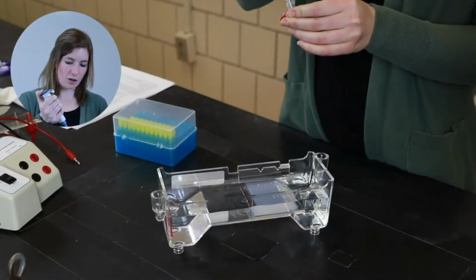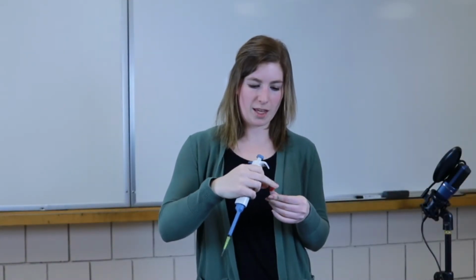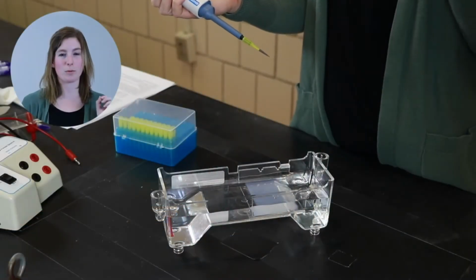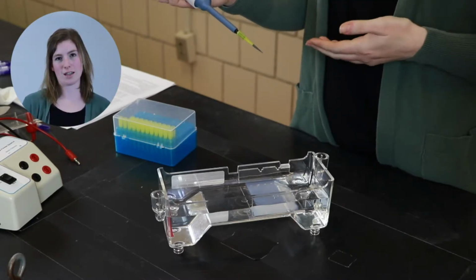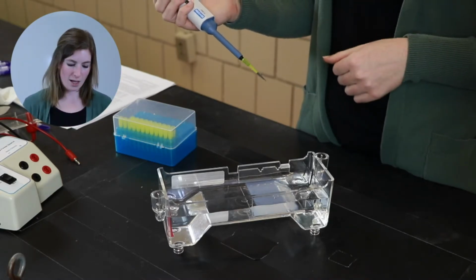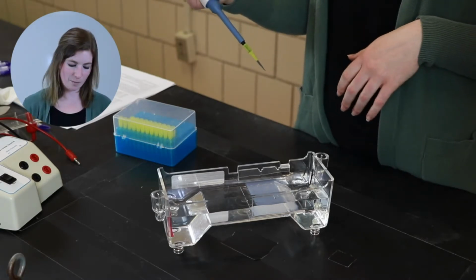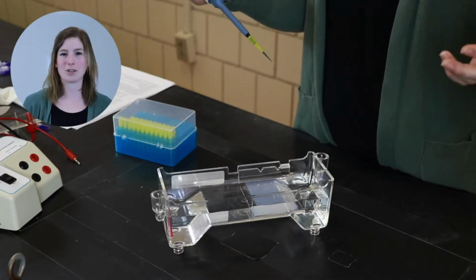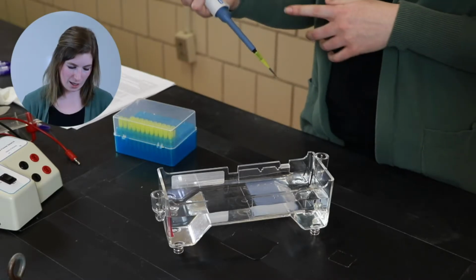So I'm going to go ahead and grab the 35 microliters out of this tube. And I have to be really careful when I load my samples because I need to make sure that I get it into the well, but I don't want to go too far because if I poke through the gel, it will mess up how the liquid DNA sample runs through the gel. If there's a hole, it's going to kind of leak out and we're not going to get the results that we need. So you have to be really careful. If you guys were here doing this with me, we would practice this a lot the day before because it is kind of complicated.